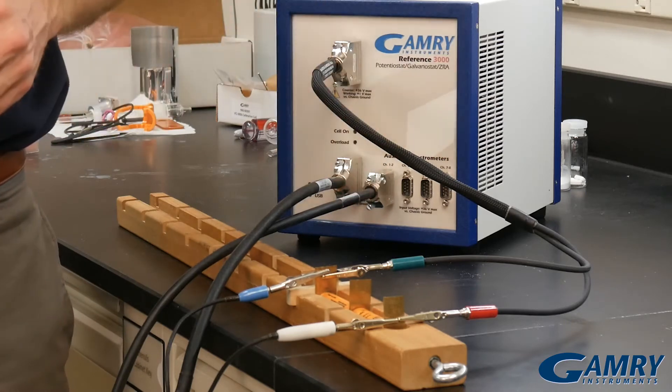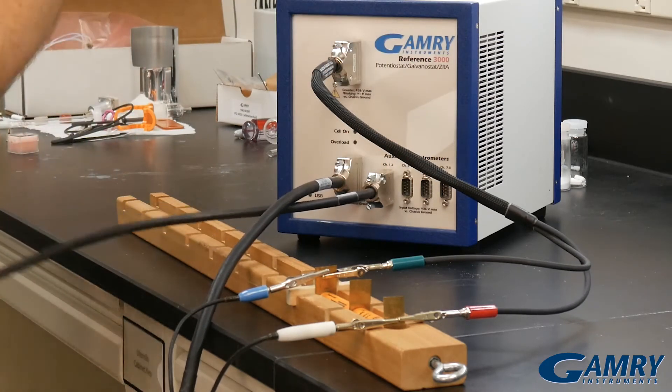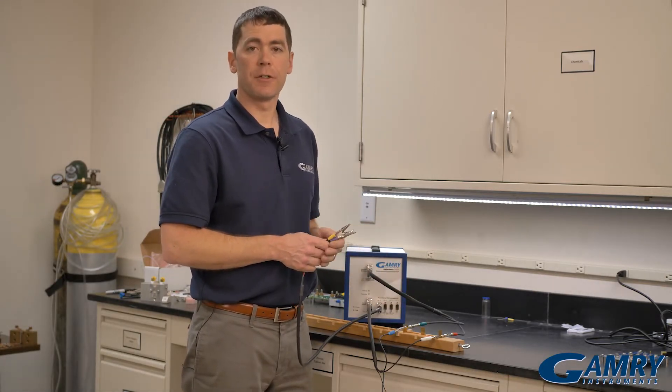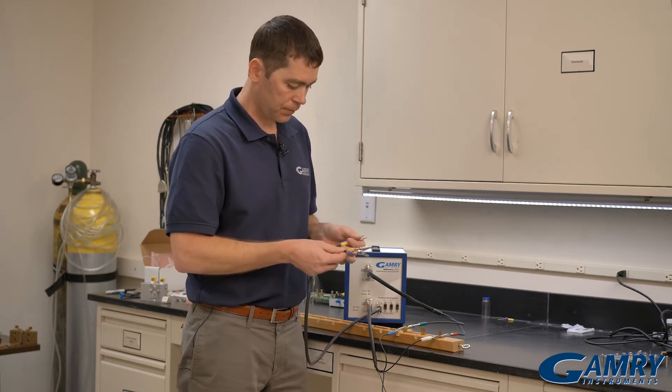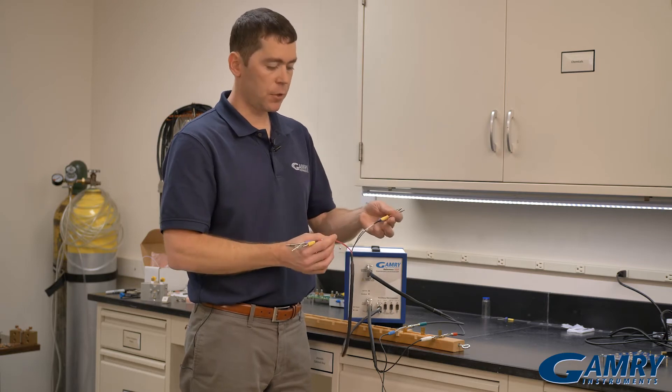Now I can connect to each individual cell using the auxiliary electrometer cable. There are four cables for the auxiliary electrometer. Each cable has two channels in it and they're color-coded — one channel is red and one channel is black.